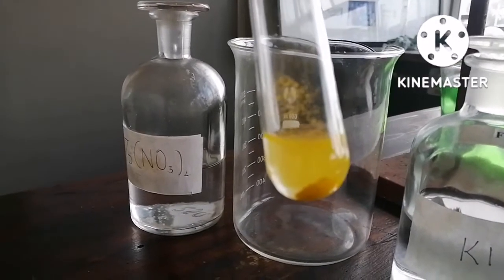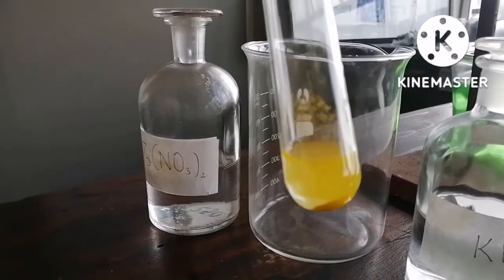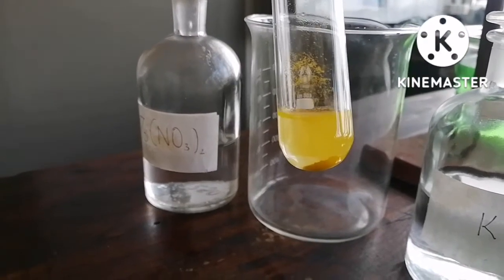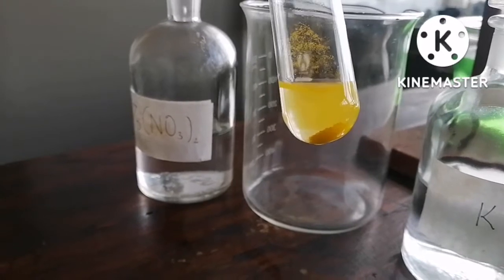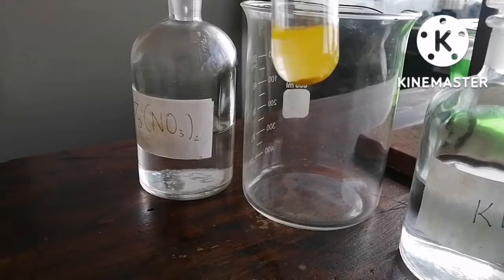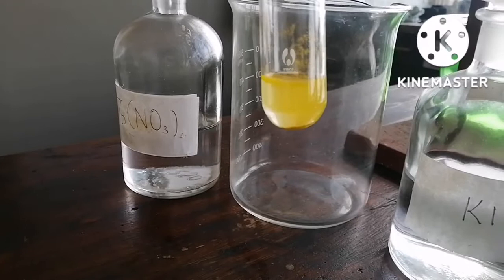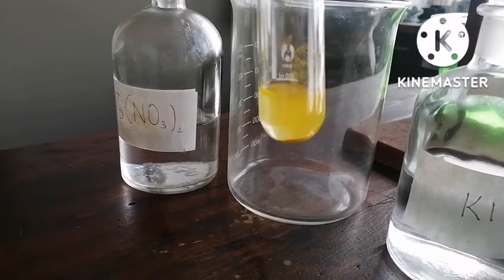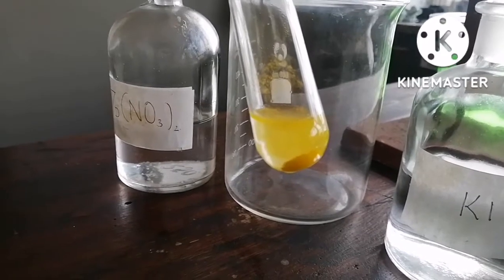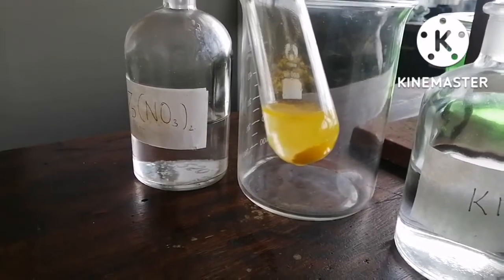So you've got lots of evidence of a chemical reaction happening. You've got a color change, you've got a change of state, and in that reaction you have lead nitrate reacting with potassium iodide. Then the yellow solid precipitate is lead iodide, and what will eventually be a clear, see-through solution is potassium nitrate. So those are your products there, and that is the classical precipitation reaction with the bright, beautiful change of color.